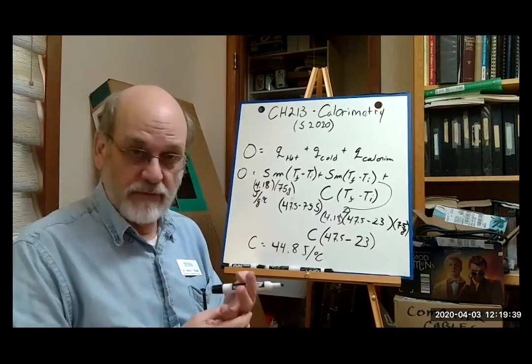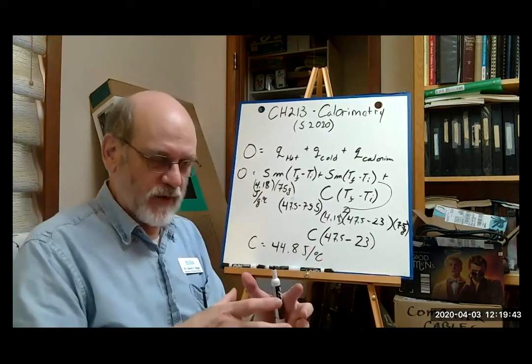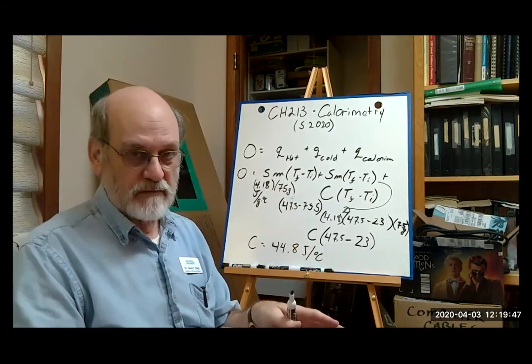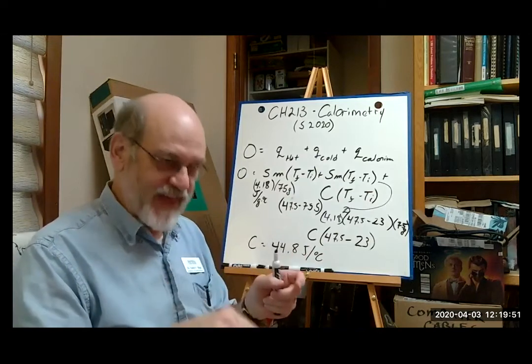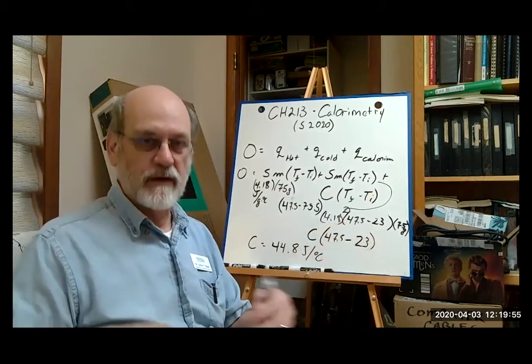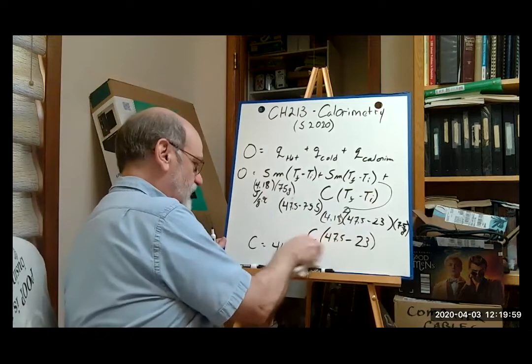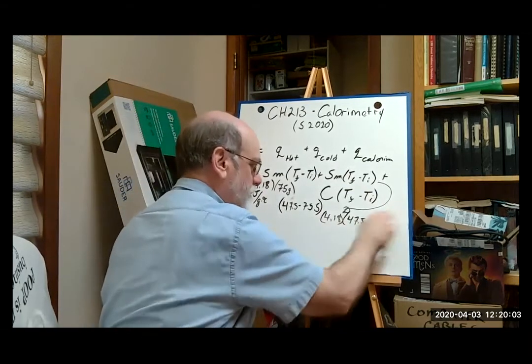That value is the same from now on, as long as you don't change any parts of its construction. If we were doing this hands-on, once you construct that calorimeter, including the thermometer, you don't change it. The thermometer stays in there. You don't use a different thermometer, just that thermometer. If you need to measure temperatures elsewhere, use a different thermometer. Okay, so that's our calorimeter constant.